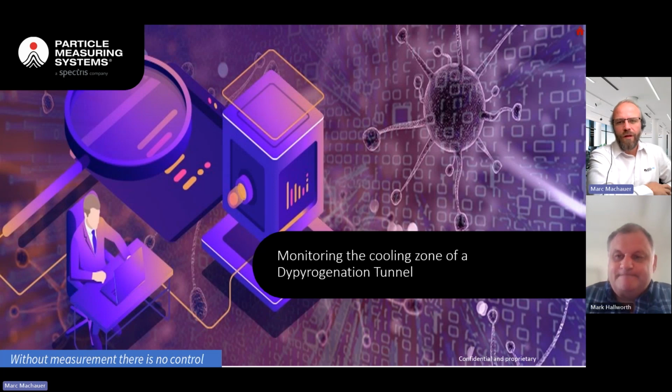Yep. Today we have a topic. We decided to talk about the monitoring inside the depyrogenation tunnel because there are so many questions, especially now with the 1 meter limit. It's basically impossible to do it in the tunnel. So everyone is asking us lately what to do.